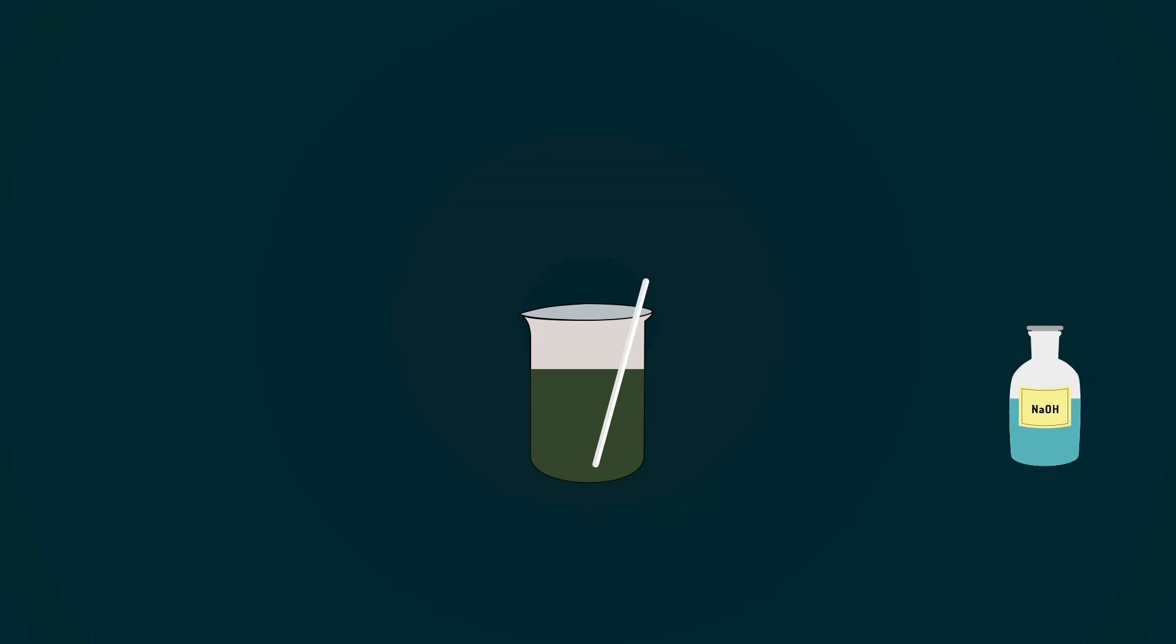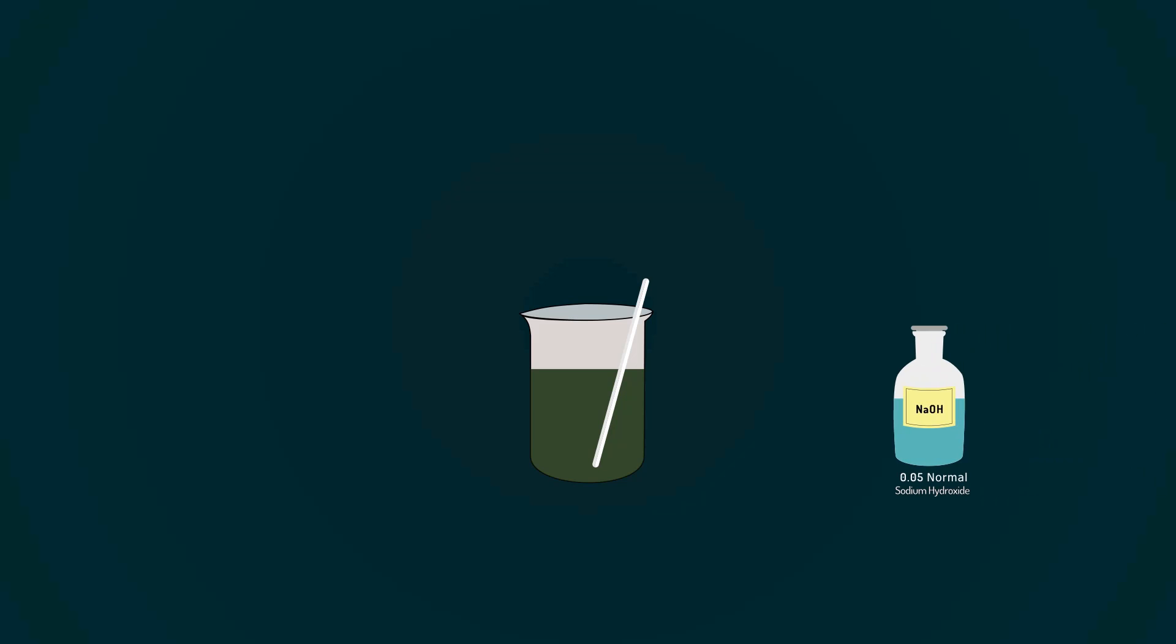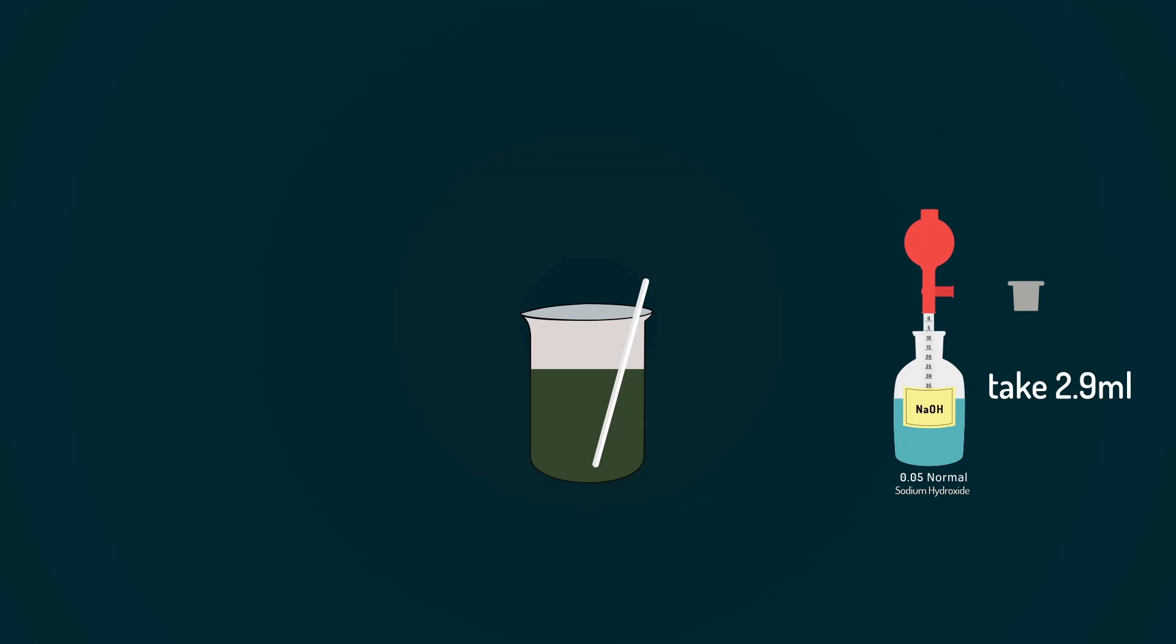Now, take 0.05 normal solution of sodium hydroxide, pipette out 2.9 milliliters and put it into the beaker.